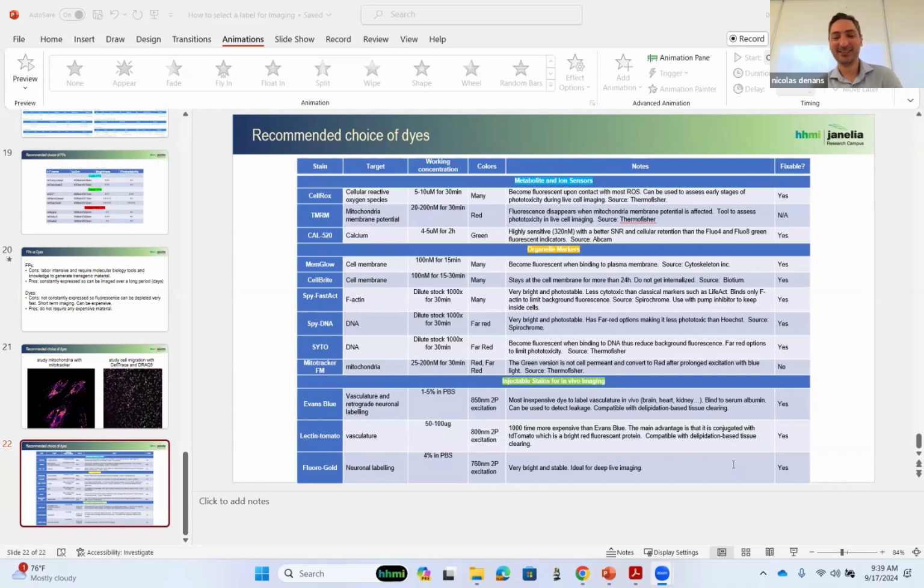But I wondered if you could comment a little bit on your experience of longevity of storage, given the price tag often associated with these sorts of dyes. How do you find they keep in storage, if people are going to invest in them? Do they work quite well stored in the fridge, or what about thermostability and that sort of thing? Yeah, that's actually a big challenge.